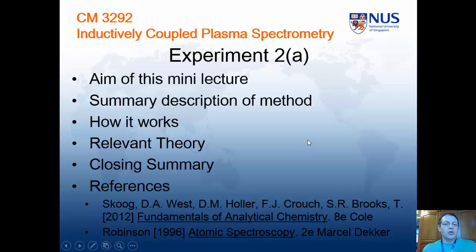Hi guys, welcome. This is module CM3292 and this is the mini e-lecture on inductively coupled plasma spectrometry. That's experiment 2A. So the structure of this lecture is on the page in front of you.